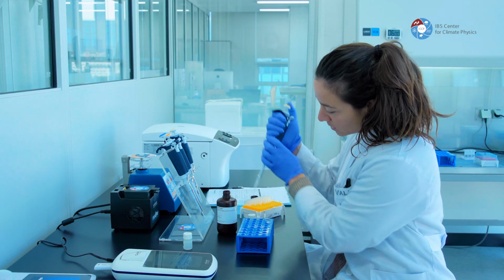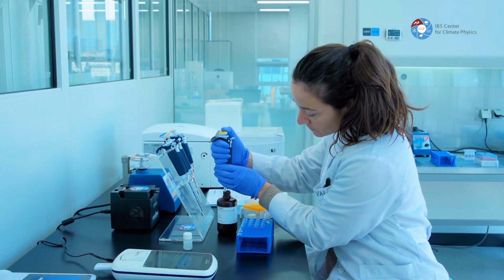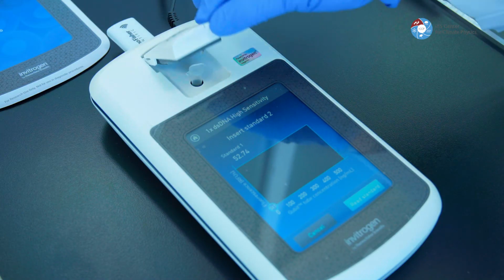In my lab, I process soil and sediment samples and swabs that I collect in South Korean caves. In the first step, I determine the amount of DNA in the samples using a Qubit 4 fluorometer. Then I proceed with the library preparation, which consists of a series of chemical treatments of the DNA solution. The prepared samples are then inserted into a MinION sequencing device.